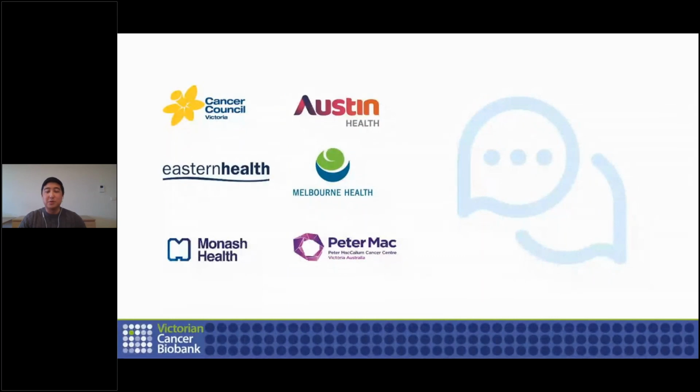In terms of user interface, it's quite standard and does the job really. E-consent would be great, and integration, as well as improvements in terms of the auto generation tokens to auto generate tissue bank numbers. If there was an easier way to do that, that would be great. Sure. Okay.